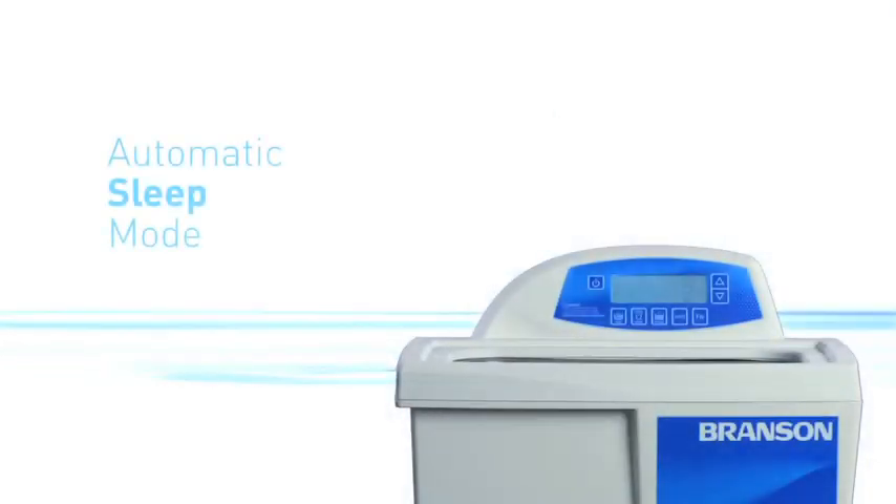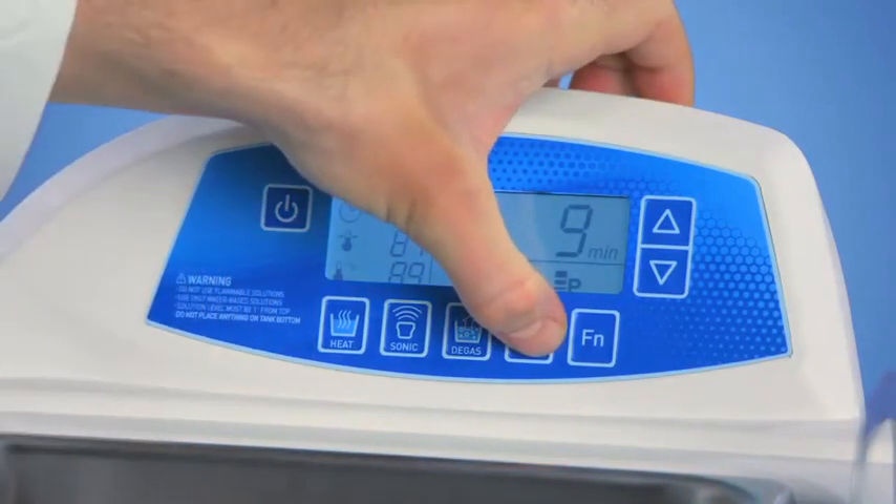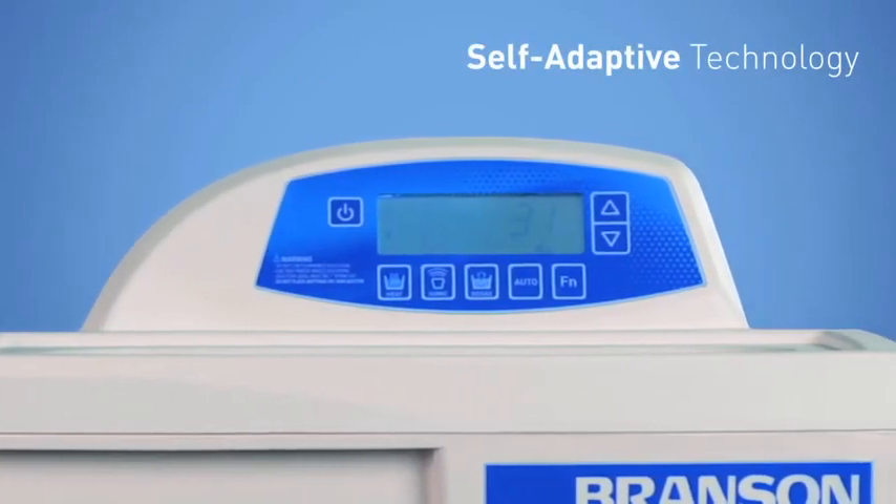Once the runtime is complete, the digital bath will shut off automatically, delivering the same results every time. For even easier operation, the Bransonic Digital Bath can also run in manual mode for push-and-go operation.